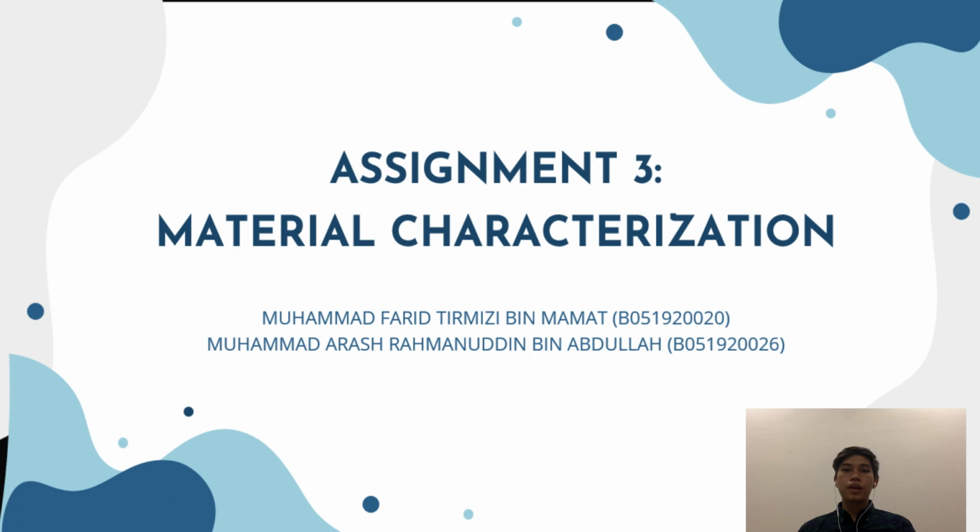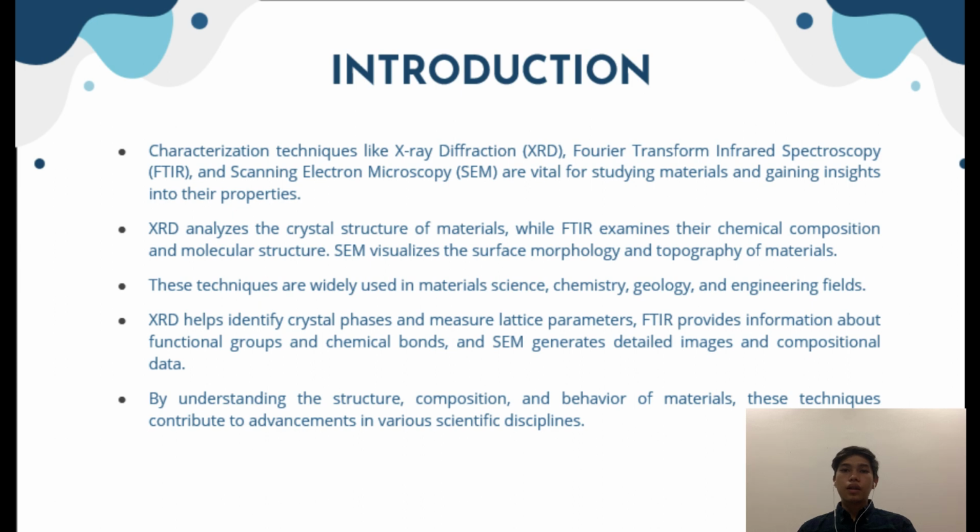Today we will present about characterization techniques for various materials. For introduction, characterization techniques like X-ray diffraction, Fourier transform infrared spectroscopy, and scanning electron microscopy are vital for studying materials and gaining insight into their properties.